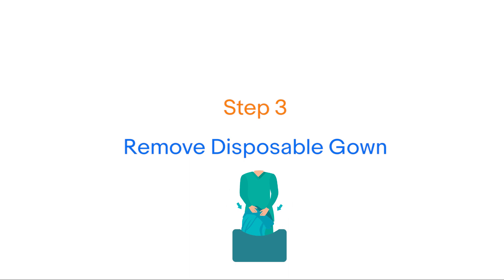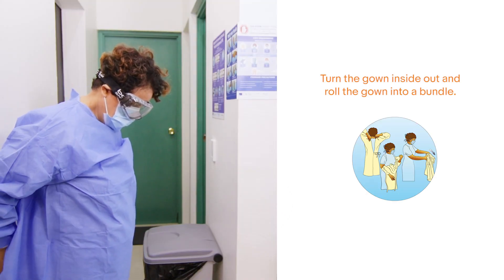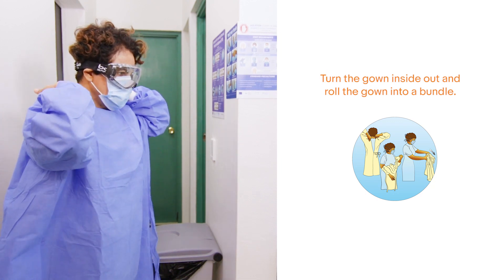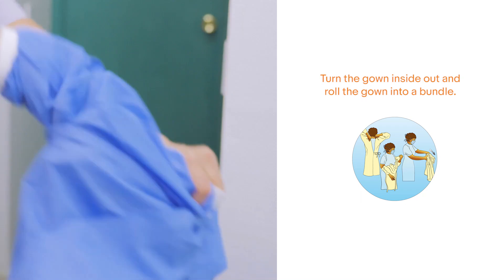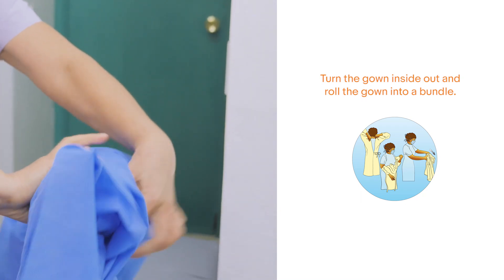Step 3: Remove the gown. Undo the ties at the neck and waist and roll off from the neck and shoulders, making sure to keep the gown away from touching your clothes. Turn the gown inside out, roll it into a bundle, and discard in a waste bin.